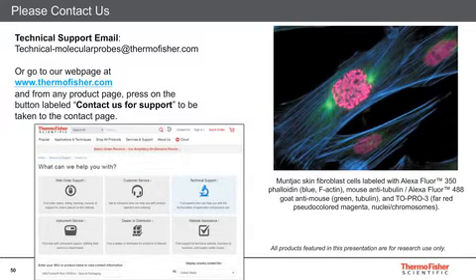Well, remember, this is about the charge on the dye, right? So most dyes have a negative charge. For instance, the Alexafluor dyes and fluorescein, and those have a net negative charge which will bind to positive areas on the cells or tissue. But they're all a little bit different in terms of how badly they'll bind. There are a few dyes out there, like Texas Red, for instance, which are zwitterionic, where it has one positive and one negative, so a net neutral charge. But even they can have a little bit of background binding due to charge.